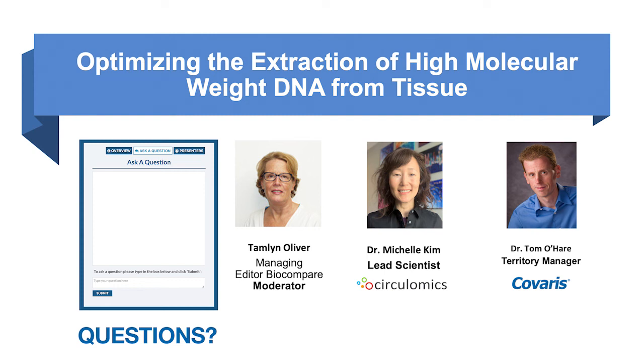Okay, thank you. I just want to say we have time probably for 4 or 5 more questions. So, Michelle, is there any development planned for metagenomics, for example, looking at feces samples? Yeah, I love all these questions. They're just totally our jam. We are currently working on a process for metagenomics. We haven't worked with feces samples yet, but it is on our list of things to figure out how to tackle.